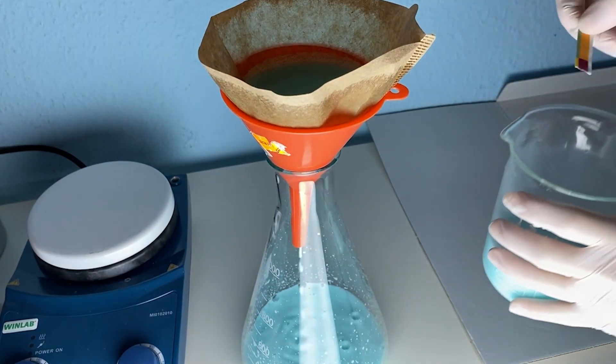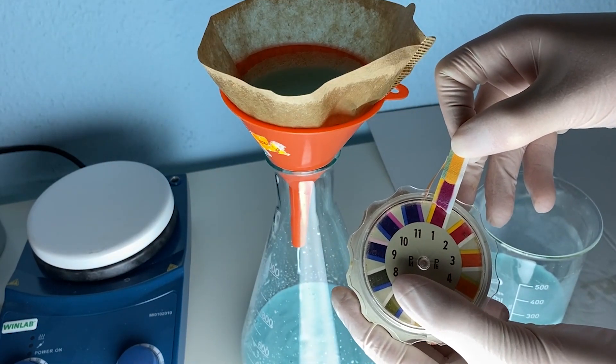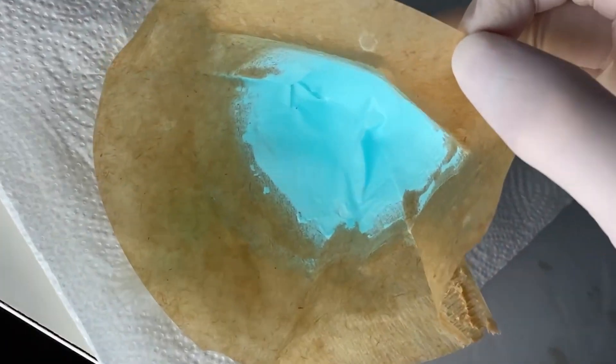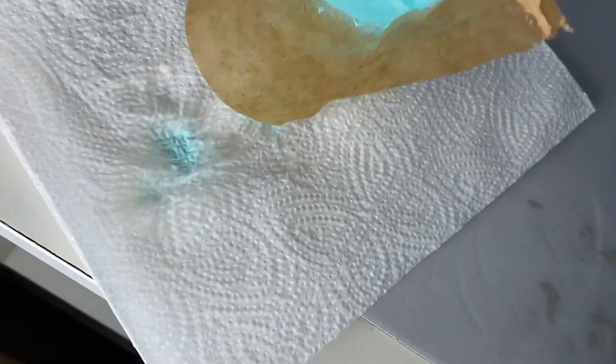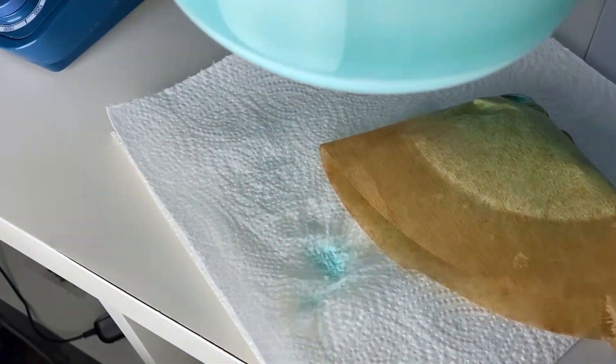I also tested the pH of the solution which turned out to be one. This should be the sulfuric acid, but I'm not sure if some oxalic acid didn't react. After that I filtered it again because I didn't get a lot of product, which is probably because of a leak in the filter paper.